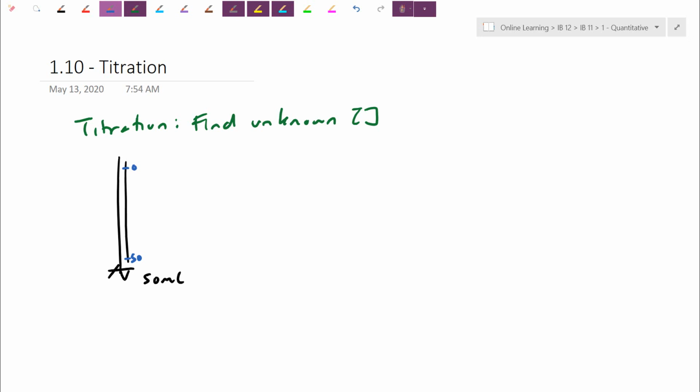Once you're sure that this stopcock valve down here is closed, what I tell people normally is just fill the burette, something more than half. You want to make sure you have enough solution inside here to accomplish the entire reaction without necessarily having to refill the burette. Every time you refill the burette, you're going to introduce more error. Because of the markings as they are, we have the 0 mark up there, 50 mL mark down here.